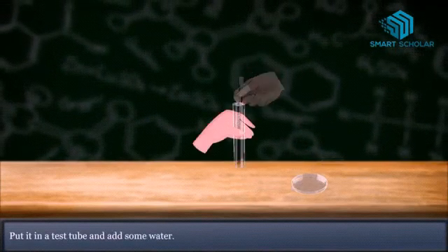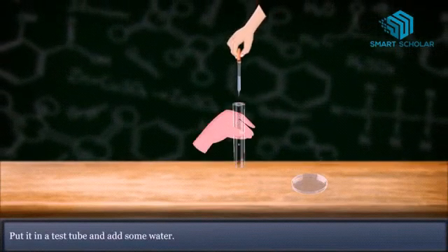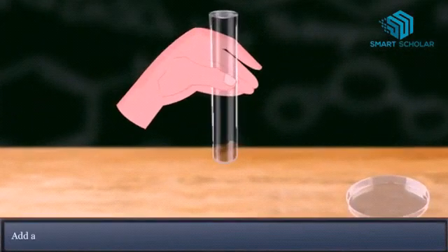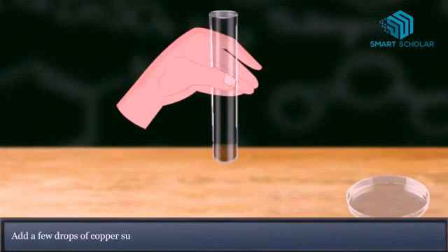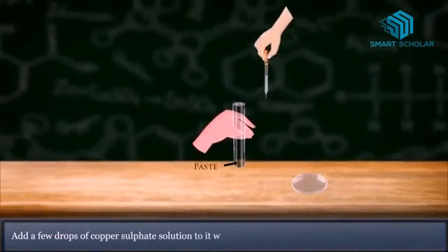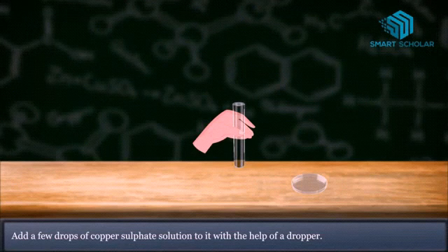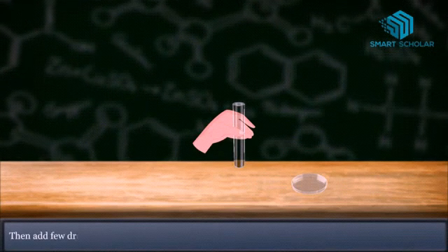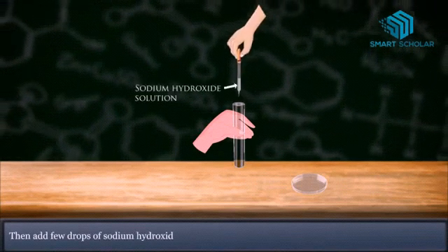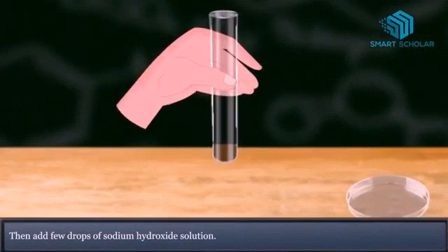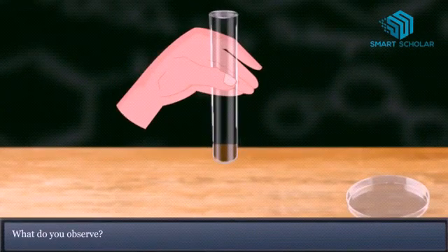Add a few drops of copper sulfate solution to it with the help of a dropper. Here the copper sulfate solution will be 2%, that is 2 grams of copper sulfate mixed in 100 ml of water. Then we are going to add a few drops of sodium hydroxide, that is 10% sodium hydroxide, which is 10 grams of sodium hydroxide in 100 ml of water.